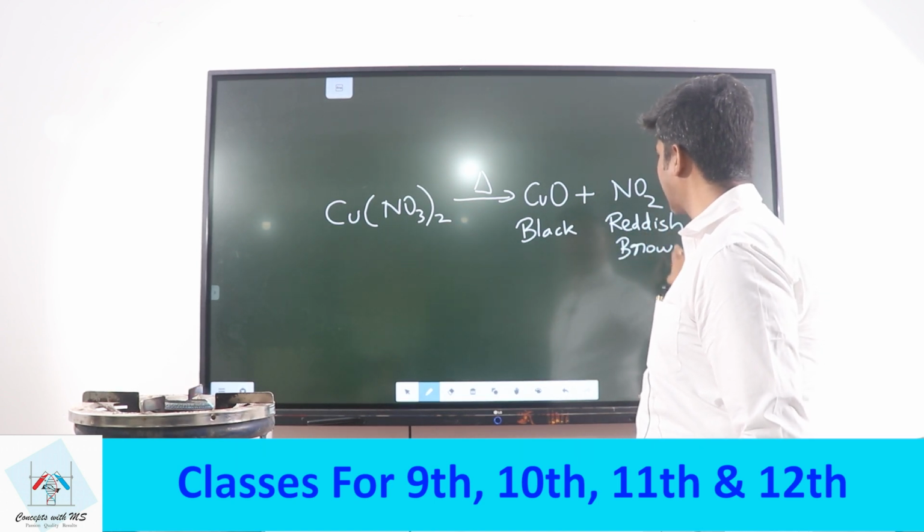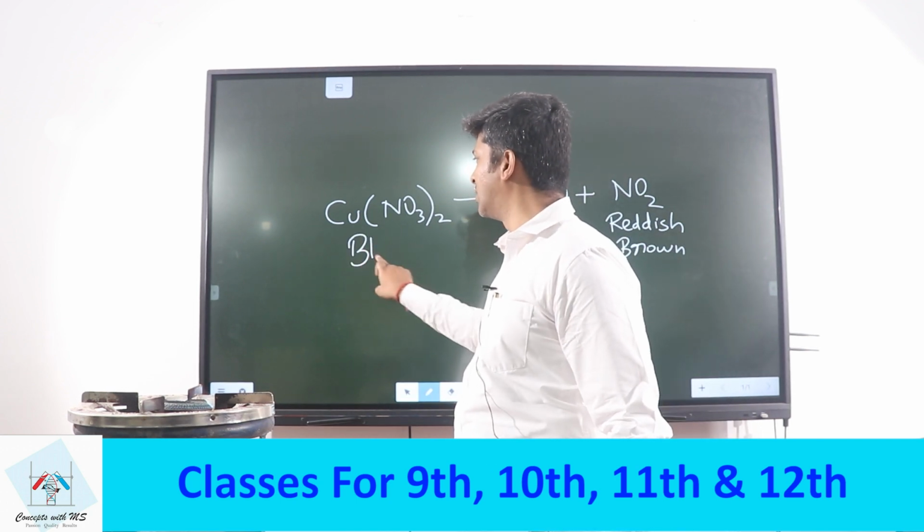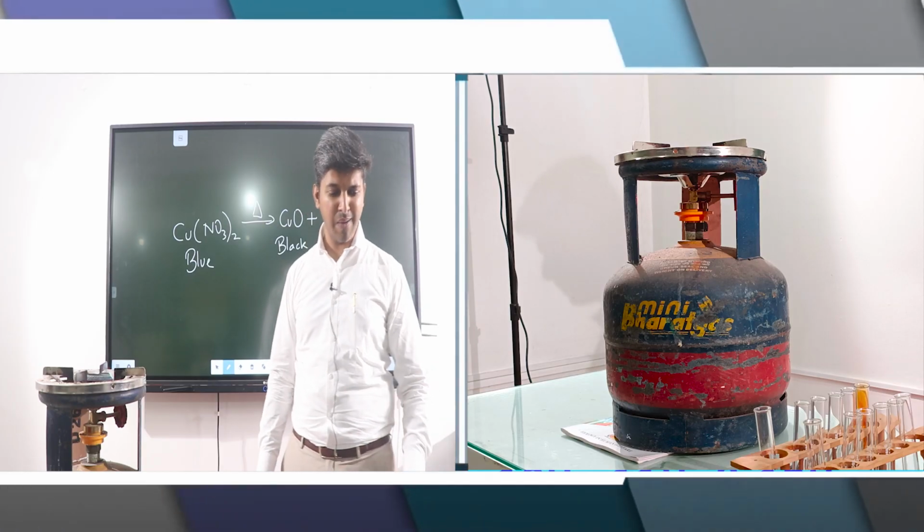And initially copper nitrate, how was it? It was sparkling blue in color.